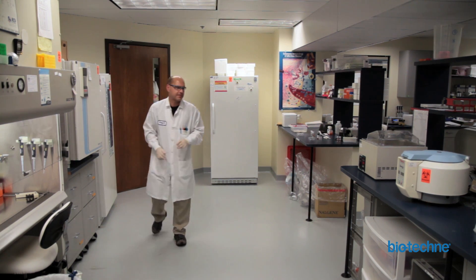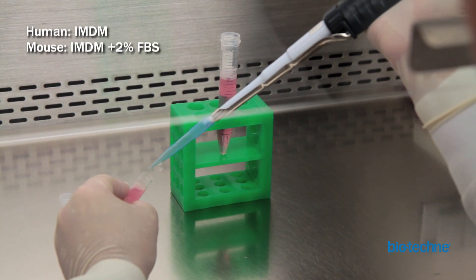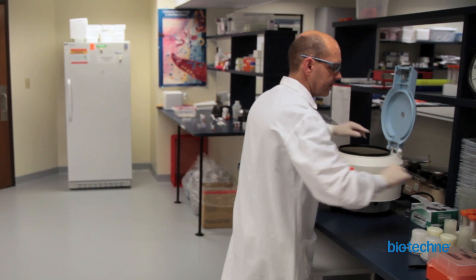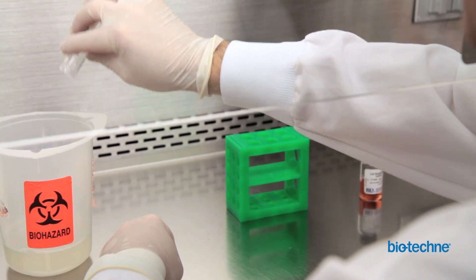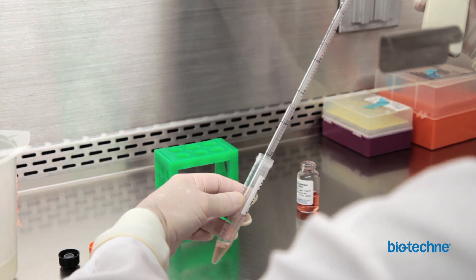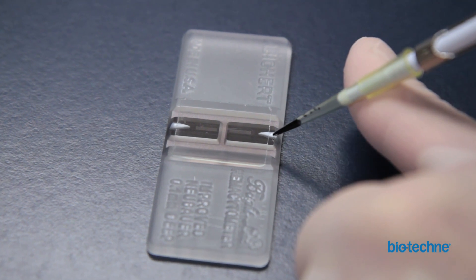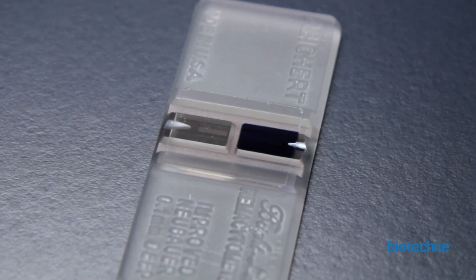Begin by thawing the methylcellulose-based media at room temperature for 30 to 60 minutes. While the aliquots are thawing, resuspend the cells in 10 milliliters of media. Note that the recommended media differs for human and mouse preparations. Centrifuge your cells at 400 times G for 5 minutes. After centrifugation, carefully discard the supernatant and resuspend the cell pellet in a small volume of pre-warmed media — cell resuspension solution for human cells and IMDM plus 2% FBS for mouse cells. Count the viable cells using a hemocytometer and a 10-microliter cell sample diluted in 0.4% trypan blue. Viable cells do not turn blue.